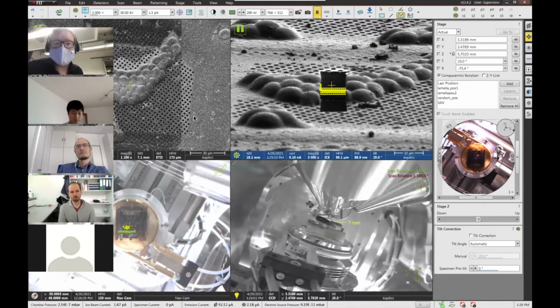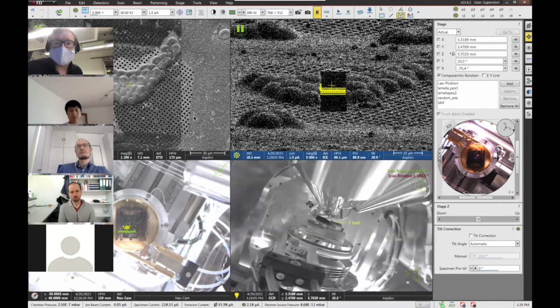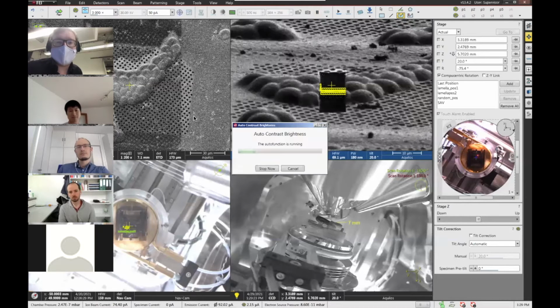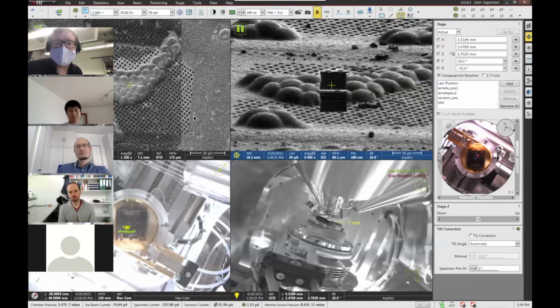At some point, it takes a little because the apertures are homed. So basically, the AutoScript waits until everything is in the right position with the apertures, while you as a user could already take images before everything is in the right position. You can see that sometimes in your ion beam image, if you change currents and take a snapshot directly afterwards, it's a little off somehow. Yeah, so this will then start the fine milling.